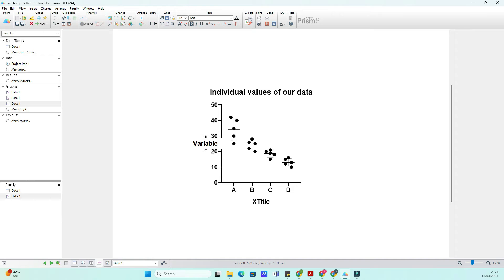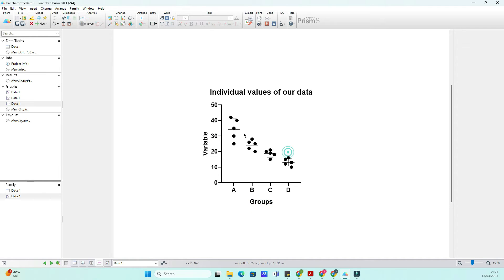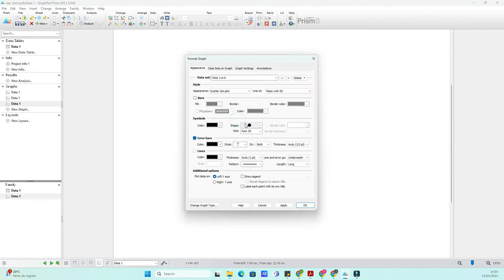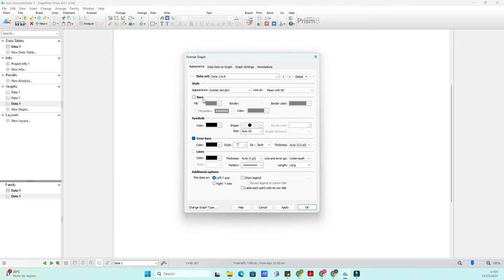For individual value plots, we'll be choosing the Individual Values plot. With your data selected, it's time to customize our plot to make it truly stunning.